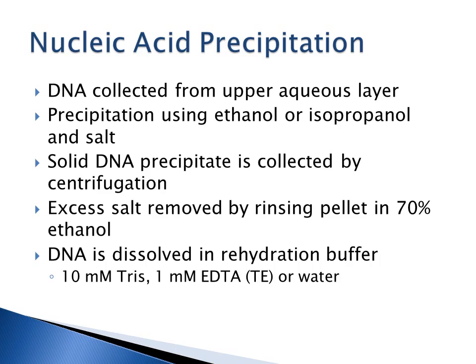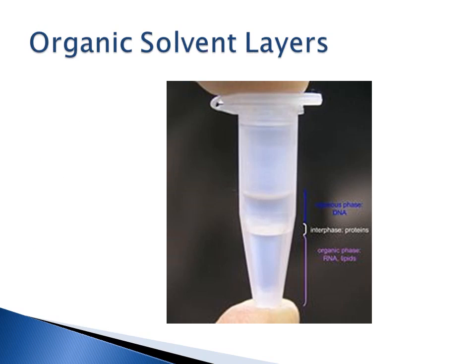And in the clinical lab, commonly we're going to isolate our nucleic acid to perform some type of amplification technique on it. So you don't want to have anything in there that might affect a protocol that you'll use down the road.